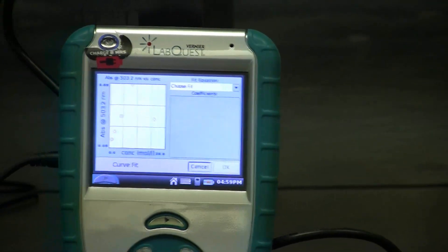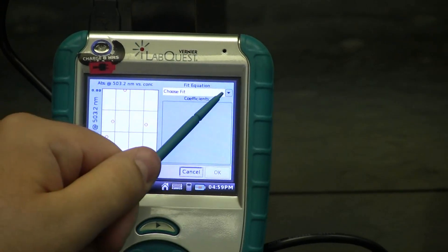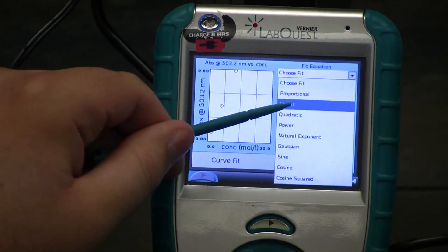Next, click on the Fit Equation drop-down menu and tap on Linear.